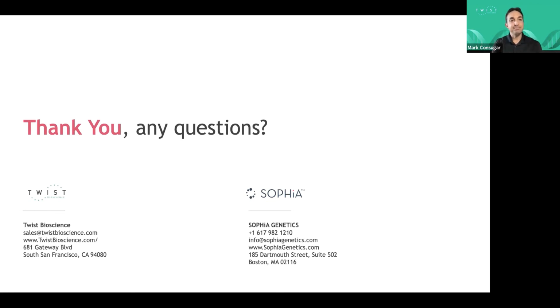Good to know. Well, that was a question from Tobias, so thank you for that. On a related note, a question from Pierre Giorgio Modena, and I think this is one for you, Emily. It's with respect to using the 8-sample reference. So in a set of, say, 24 samples, will the 8-sample reference set be fixed, or will the algorithm apply permutation testing? Will you have a permutated set of reference samples?